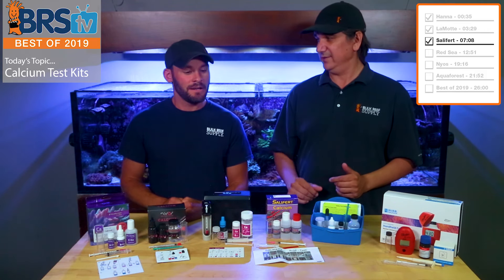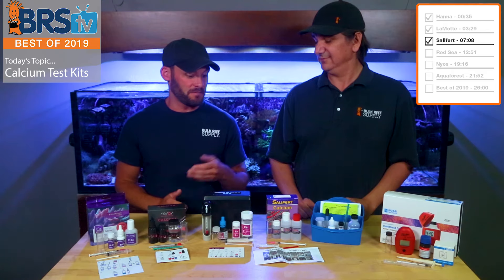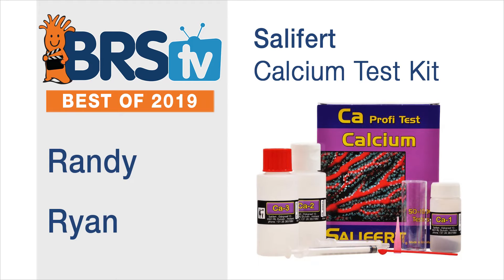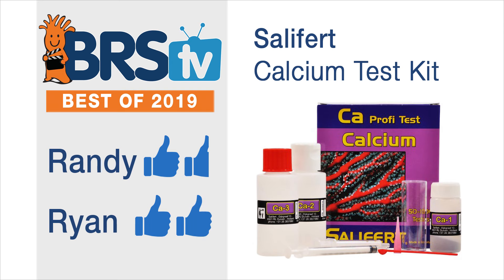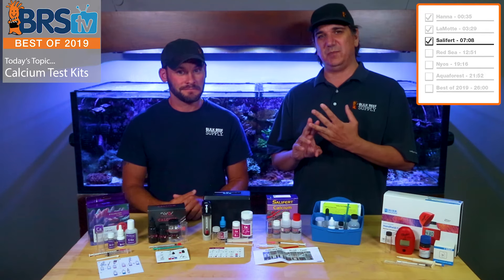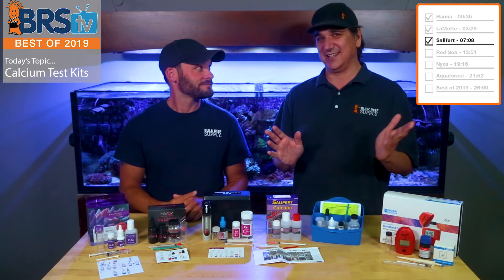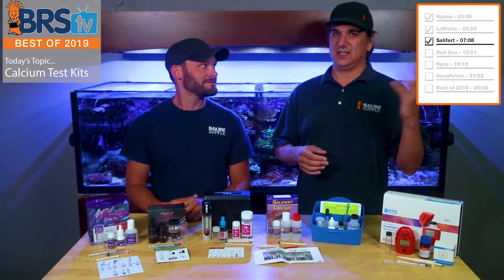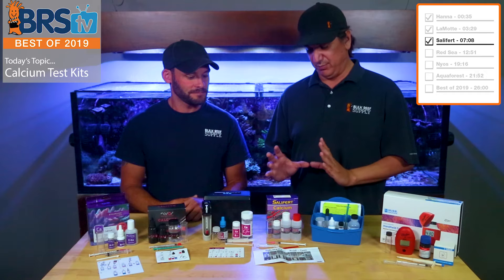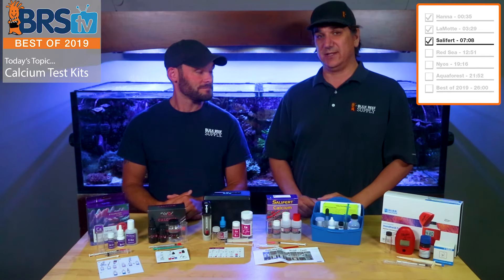For the cost, the reading endpoint ease, and the instructions — even though they are paper and will probably get a little wet — all in all, I'm definitely giving this at least one and a half thumbs. I'm going the whole way — two thumbs — based on the fact that it's the cheapest and it's delivering on that value price point. You've got good, better, best: good being the cheapest thing that actually does its job. It's a perfect mix of value — it's not perfect, but it will do the job and it will do it the cheapest.